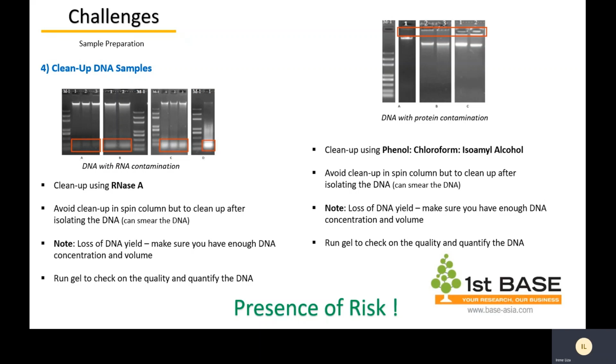Okay, now you also need to note that when you're cleaning up, there will be loss in DNA yield. So make sure you have enough DNA concentration and volume in the beginning itself before you even start the cleanup. Okay, so once you have done all the cleanup, do check on the quality, which means you run the gel again and quantify the DNA.